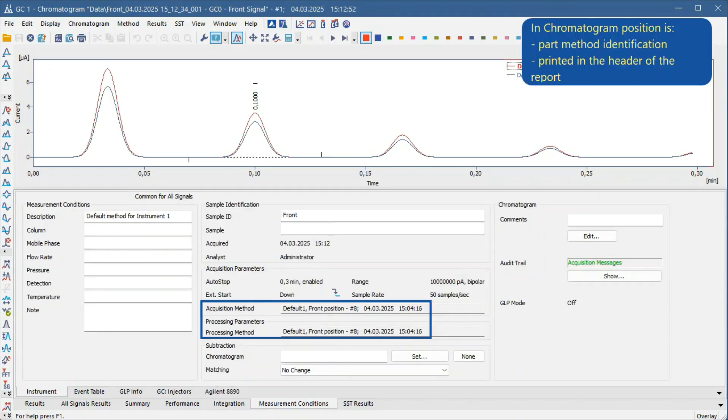In the chromatogram window, the position from which the chromatogram originated is indicated in the measurement conditions.